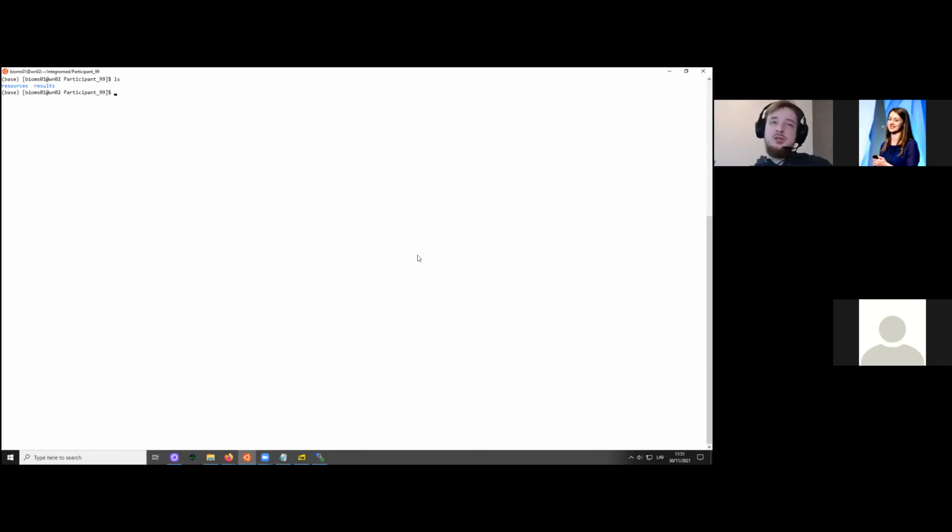But also the cutoff criteria depends on the overall quality of your data. If your data is low quality, you don't want to trim it. Let's say the mean quality is 18 or 20. You don't want to trim it at 20, because in that case, you'll just throw out most of your sequences. So most of the things we do here, you have to look at in the context of your current situation.